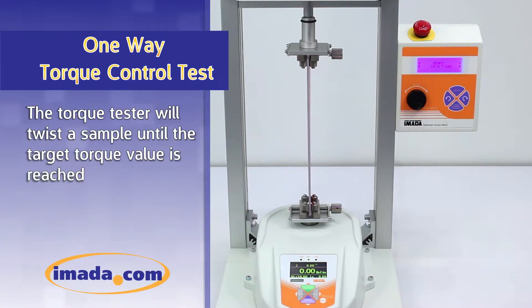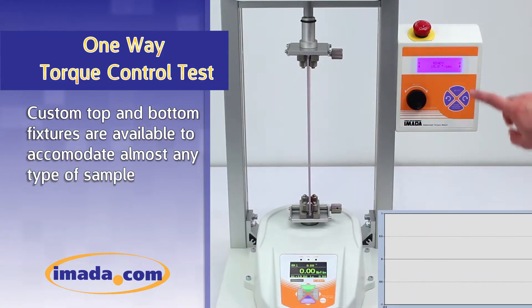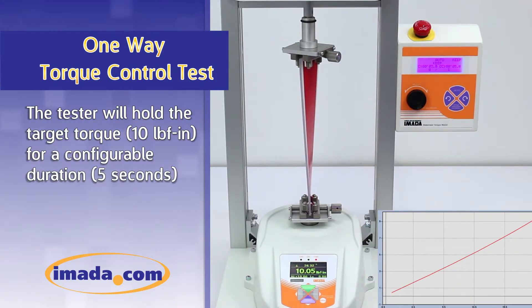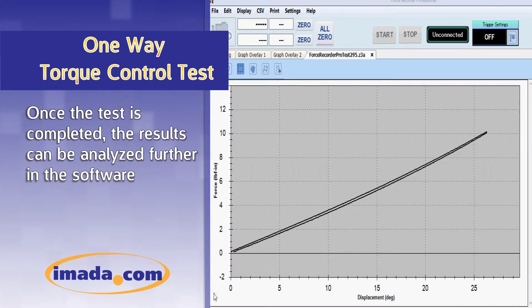The torque tester will twist a sample until the target torque value is reached. Custom top and bottom fixtures are available to accommodate almost any type of sample. The tester will hold the target torque for a configurable duration, in this case 5 seconds. Once the test is completed, the results can be analyzed further in the software.